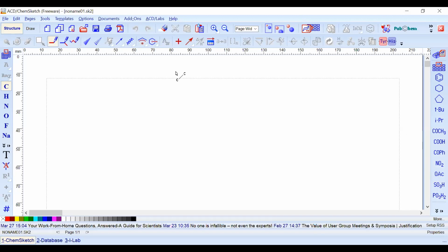Now there are some add-on features also in this particular tool. Observe where I'm keeping my cursor. This is called a periodic table of elements, because you're able to see only a few here. If you want the remaining ones to be added in your structure, you can go to this one and take up the periodic table elements also. You just click and come to your workspace. This is called the workspace.